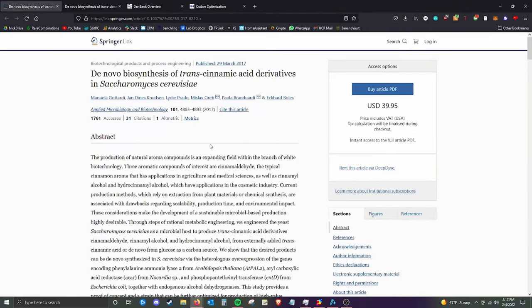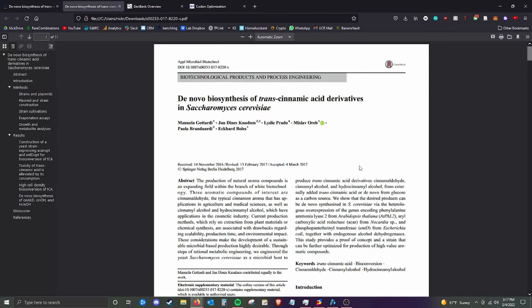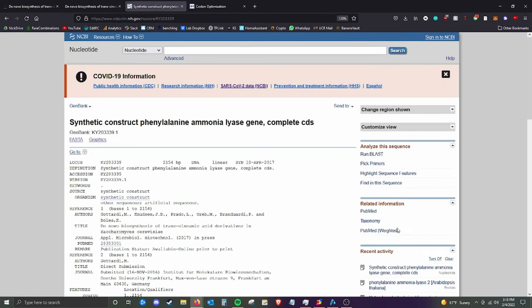The first thing you want to do is find the paper that will tell you how to do everything. We have a paper where researchers put the essential genes to produce cinnamon compounds in Saccharomyces. Use your university's VPN or something like Sci-Hub to access it. If we scroll down to the methods, we can see it lists the GenBank numbers for the DNA sequence of this first ATPAL2 gene. So you can literally just copy this and put it into GenBank.